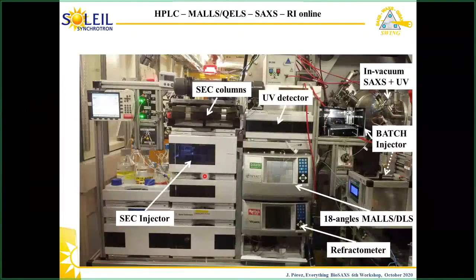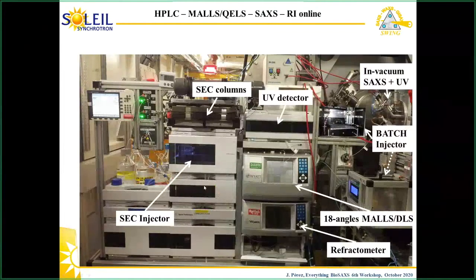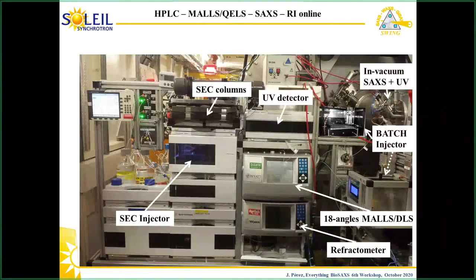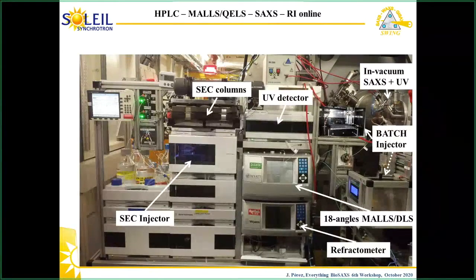Okay, so here we have two different pumps, whose roles are slightly different. One of the pumps is used to elute the sample into the capillary cell, while the other pump is used to equilibrate another column for the next experiment to come.